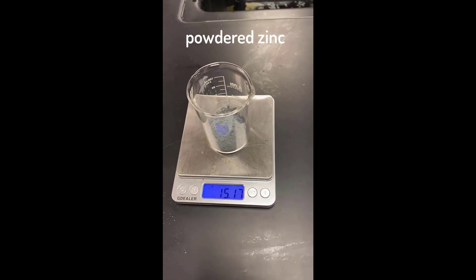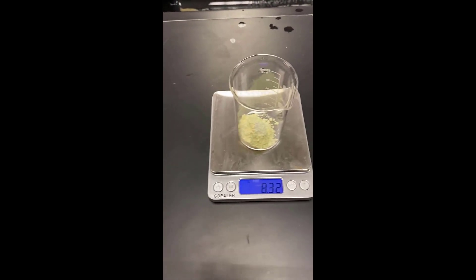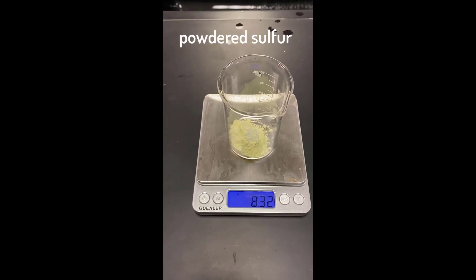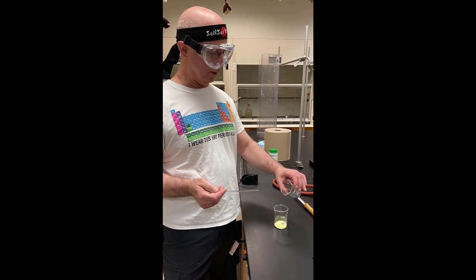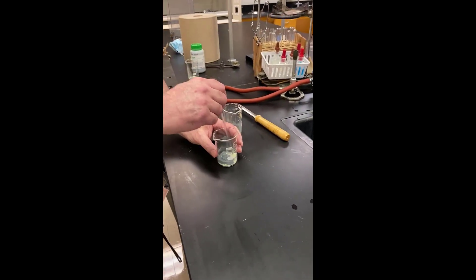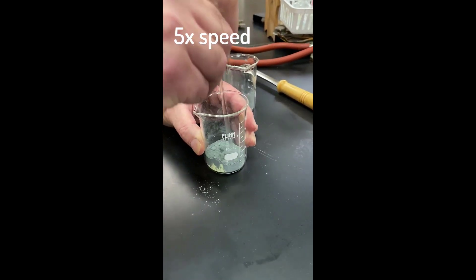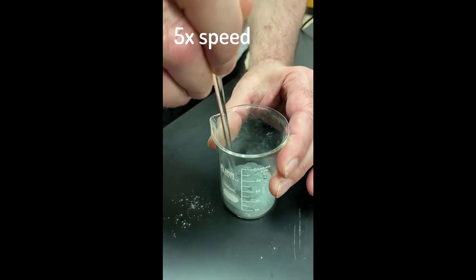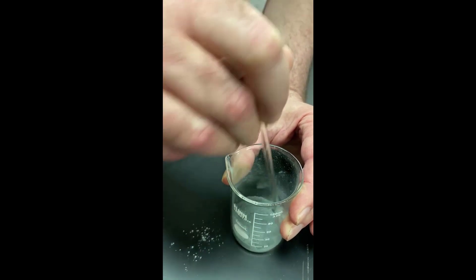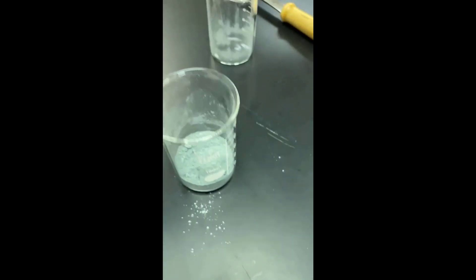So we have a mass for the zinc — that's the zinc — of 15.17 grams. And mass of the sulfur is 8.32 grams. So we're going to put the zinc and the sulfur together. That is zinc and sulfur. Isn't that the most incredible thing you've ever seen?